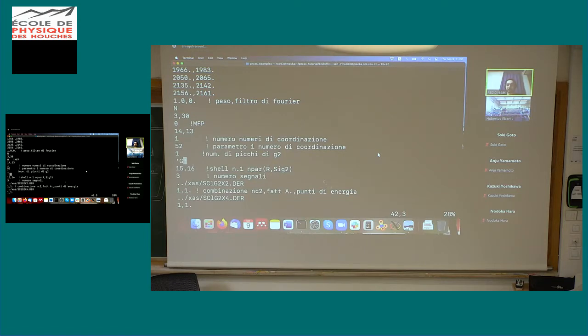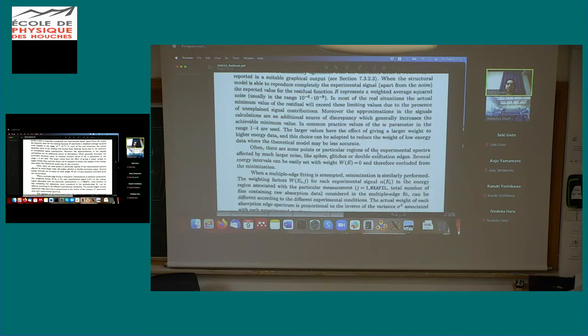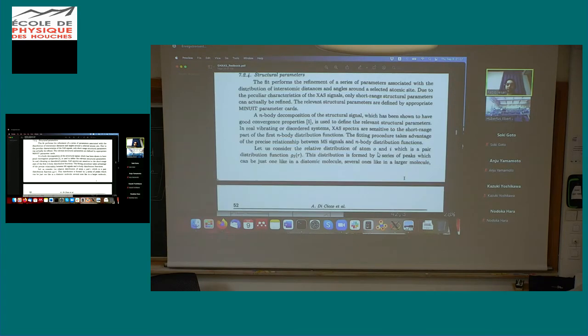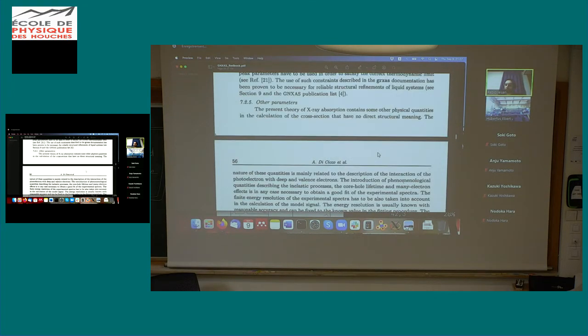Usually for 2-body there are 2 possibilities, either Gaussian peaks, which is given by this G, or we can use a gamma-like function, which is a kind of asymmetric, distorted Gaussian, let's say. And what it changes is the number of parameters that are required to fit.